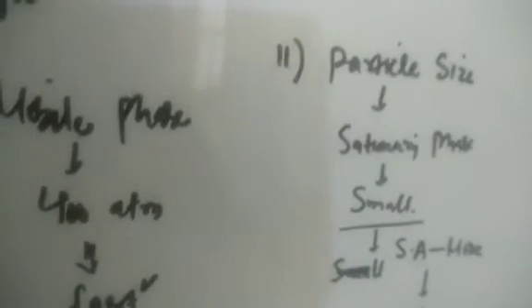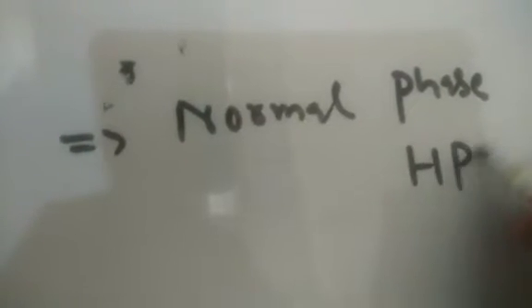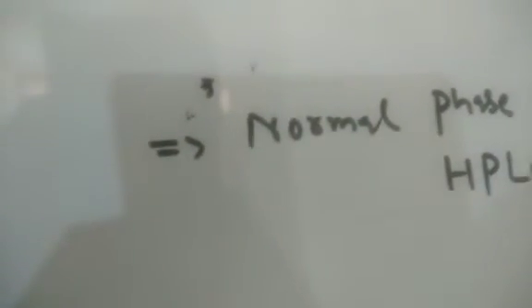Now, if we see other things, there are some improved things in the chromatography. Then we have to look at the term called the normal phase. So we'll understand normal. मैंने पहले भी डिस्कस किया था एक लेक्चर में. Normal phase. So we'll understand normal phase HPLC. Okay? And then we have one more term, that's reverse phase.